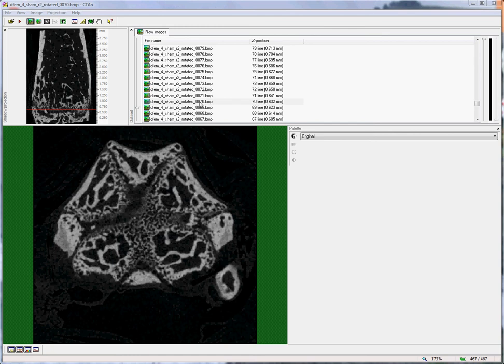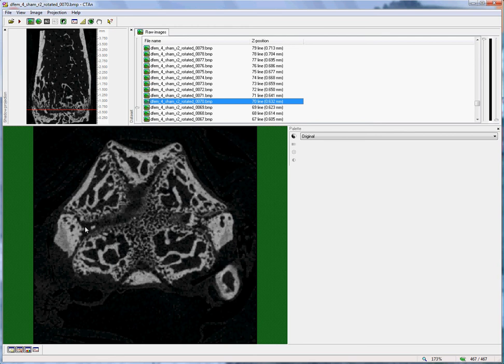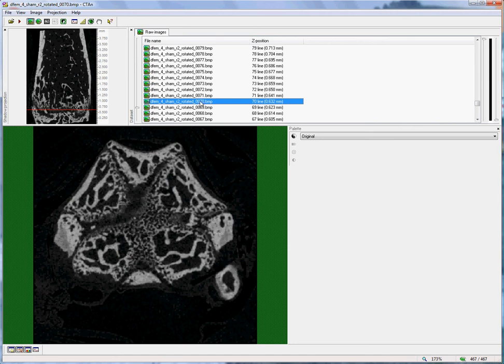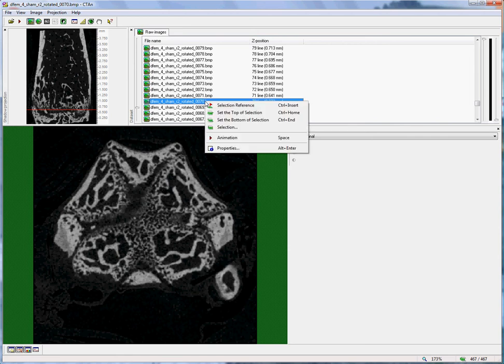Here is the reference level where the cartilage forms a bridge between two corners of the cross section, shown by this black low-density seam here. This is slice number 70. As in the case of the trabecular bone, we mark this slice as a reference level by right-clicking on it and selecting selection reference.